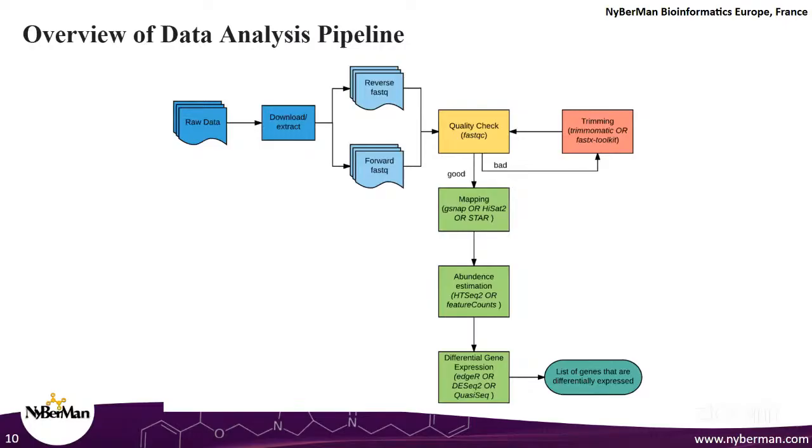So basically, think about the human reference genome as being a very long thread, right? And you have small threads, which are your reads, that come from these FastQ files. All you're going to be doing is playing match the puzzle. Okay, you're going to be playing match the following.